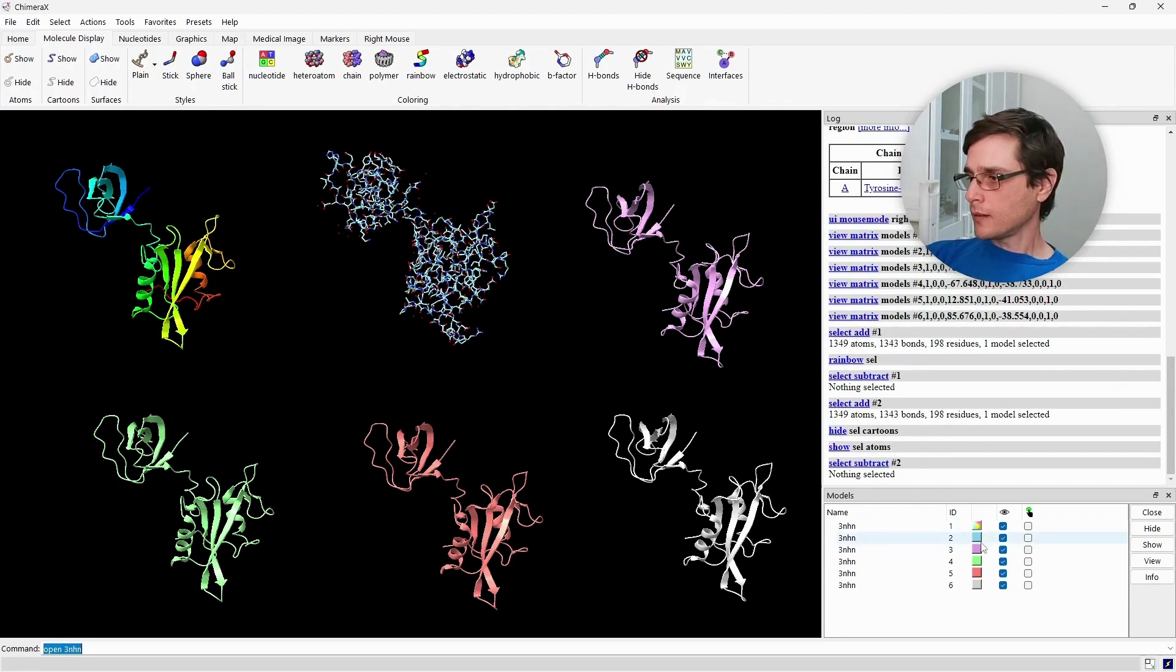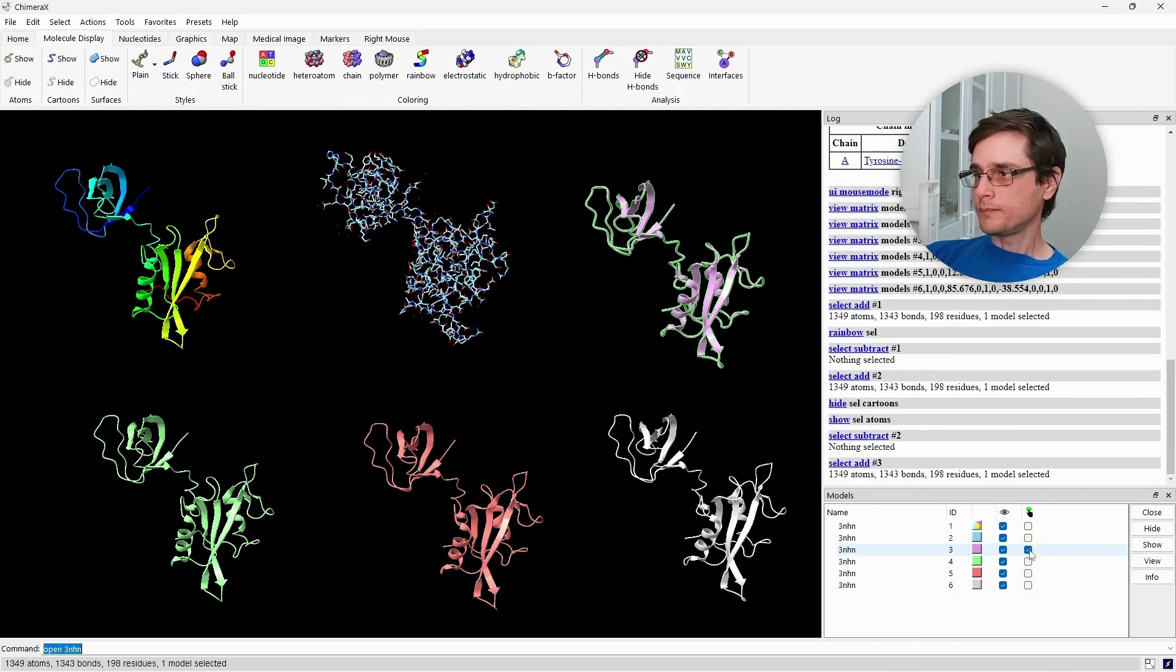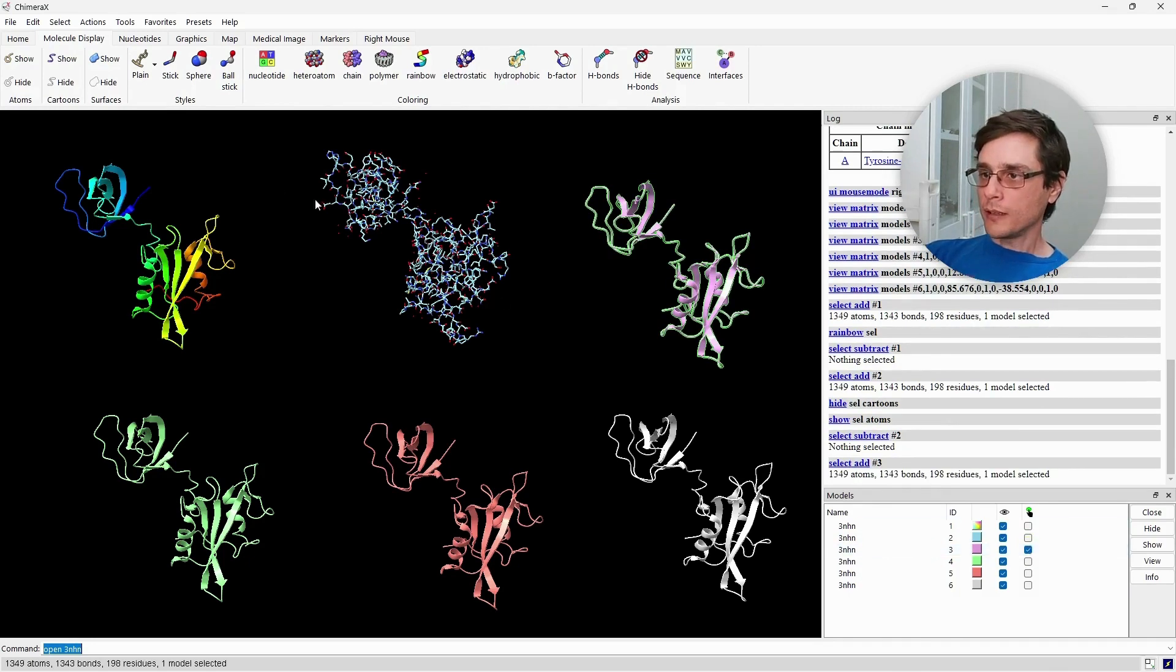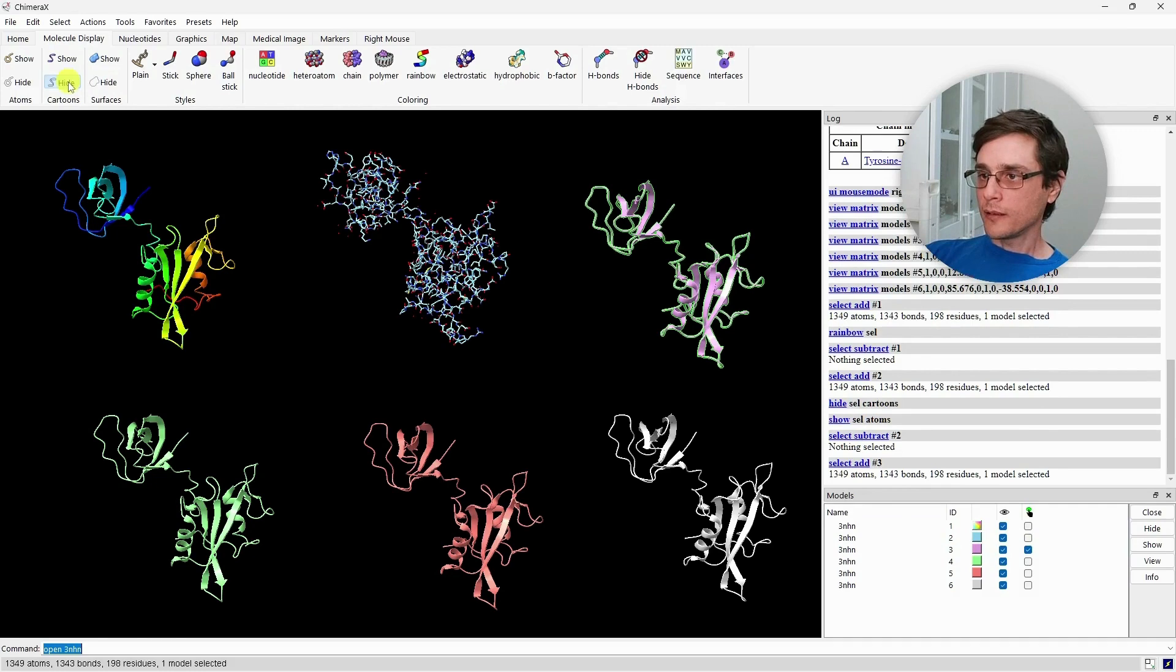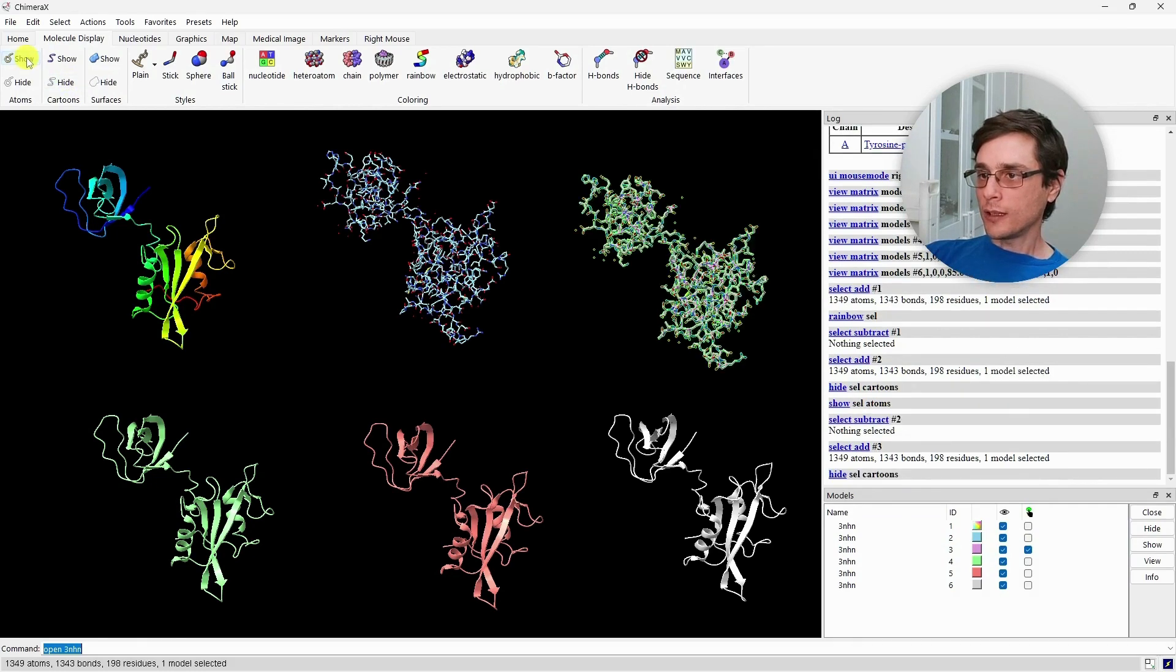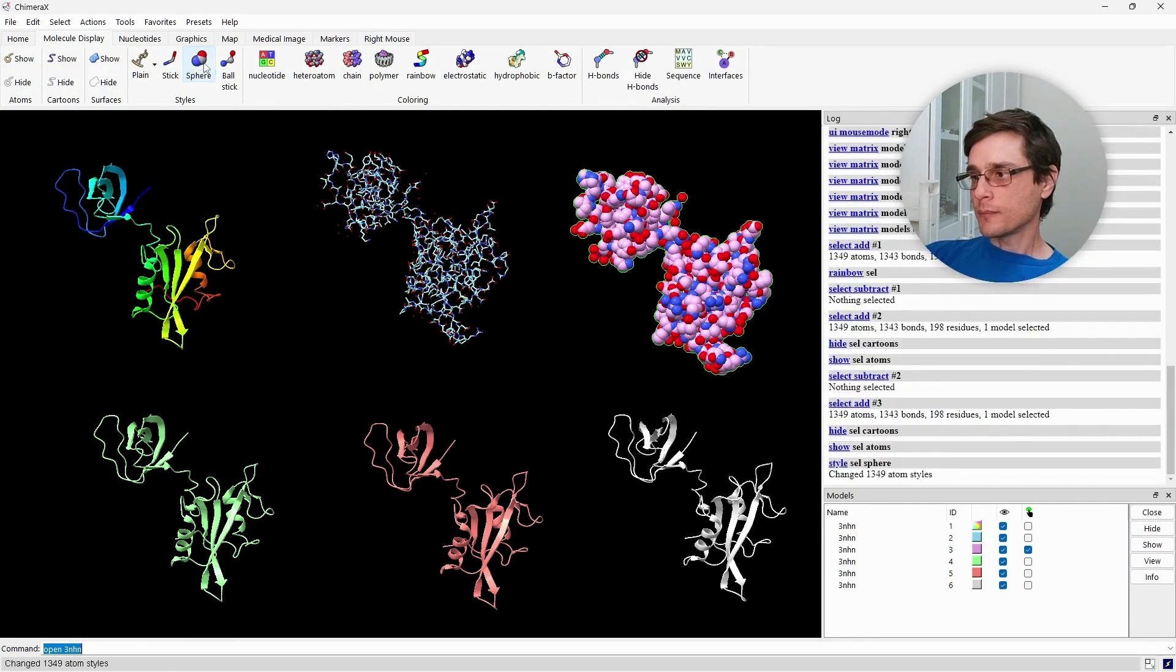Now, let's select the third model. And again, we will hide the cartoon, show the atoms, and this time style it as spheres.